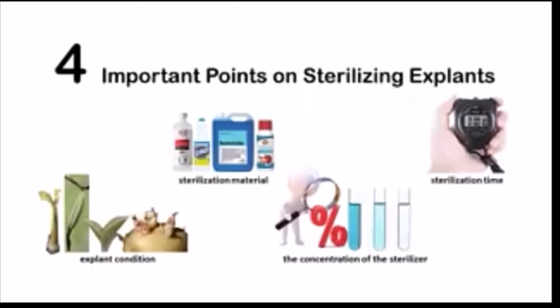One of the important stages in explant management is sterilization. The purpose of explant sterilization is to remove the source of contaminant. There are 4 important points that must be considered in sterilization of explants: explant condition, sterilization materials, the concentration of the sterilizer, and sterilization time.